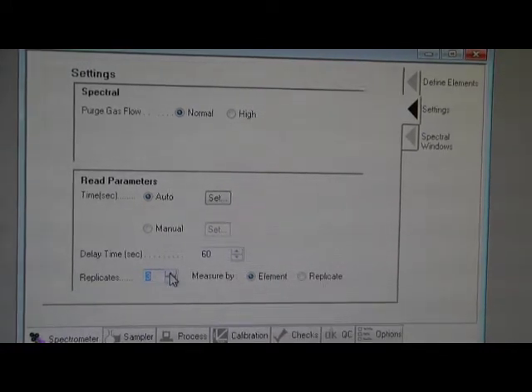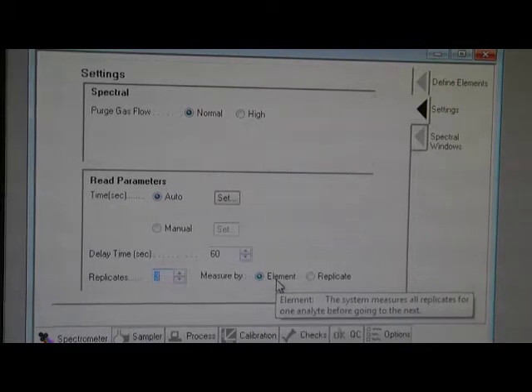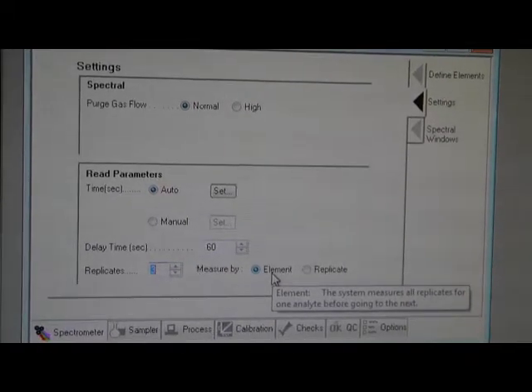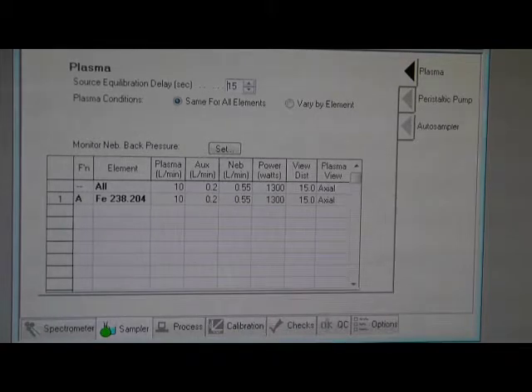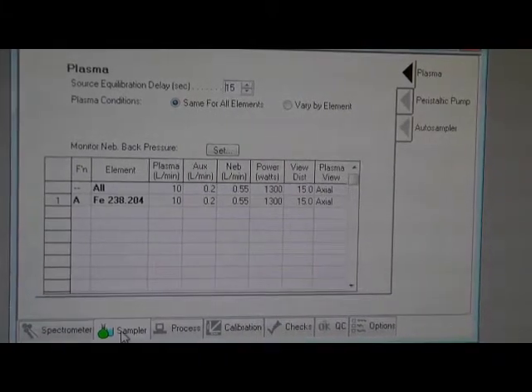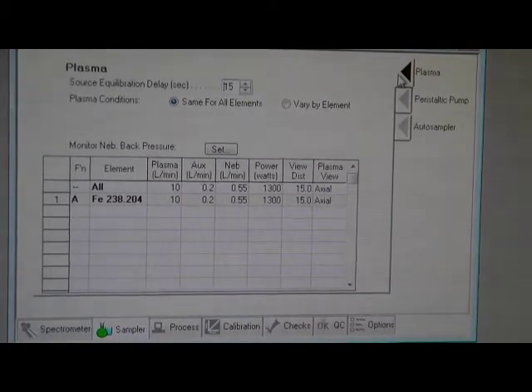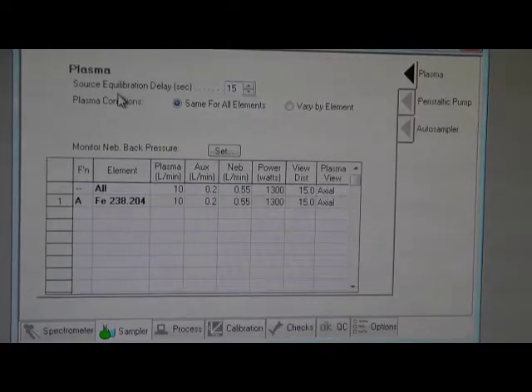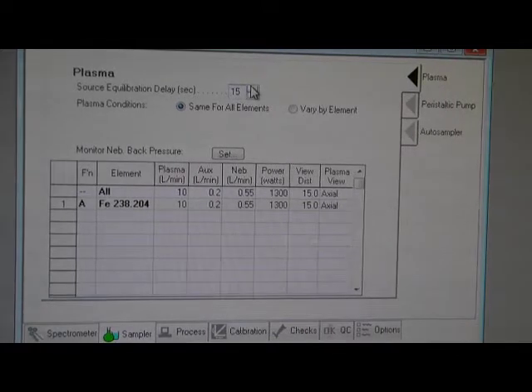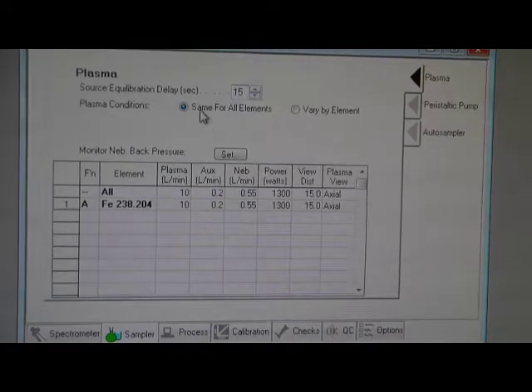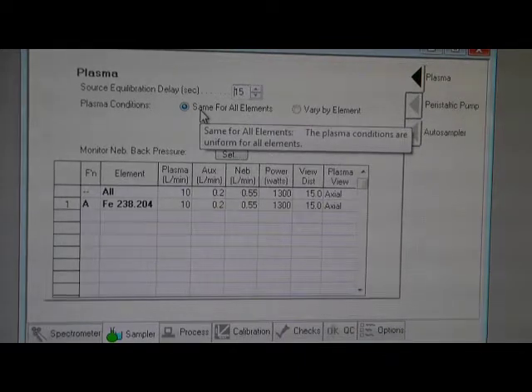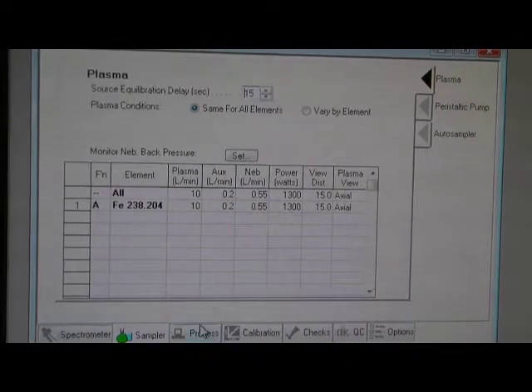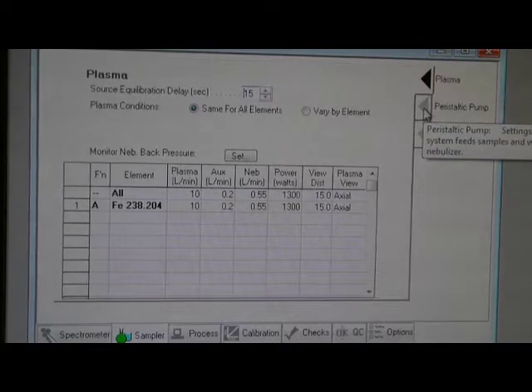Next one is the sampler. Go to the plasma. You adjust the equilibration delay: 15 seconds. Plasma condition: same for all elements.